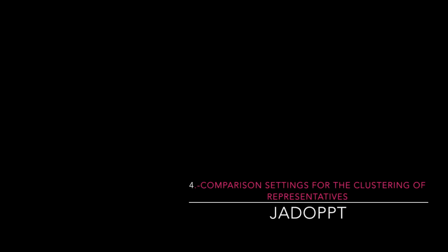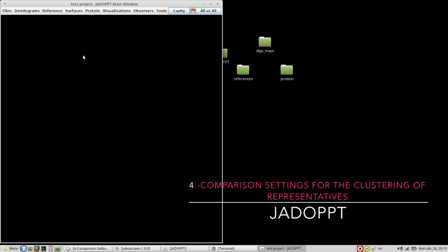Comparison settings for the clustering of representatives. Attention please! If you have not seen the previous video tutorials, please watch them before you continue with this video tutorial. Hello and welcome to the video tutorial of JADOPPT for comparison settings for the clustering of representatives.